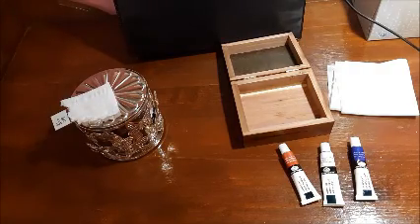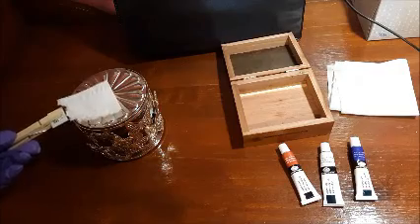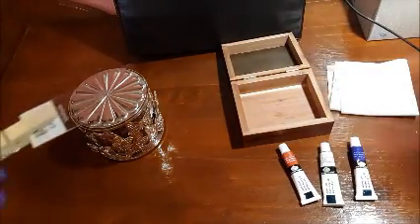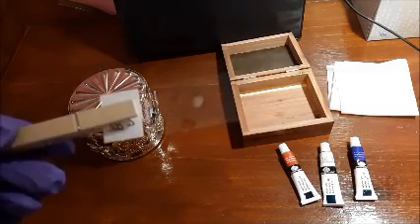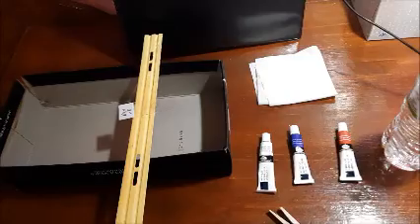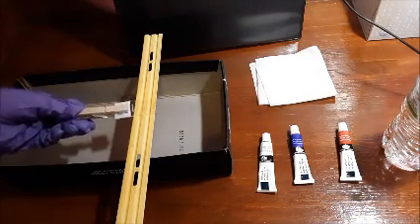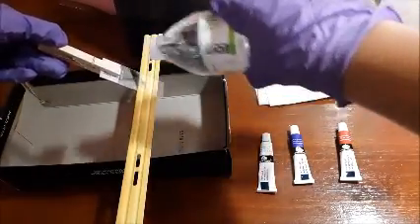After 10 minutes of steaming your heat fix slide, you will remove it using your slide clip, like so, and then carefully remove the bibulous paper. Since it's now been contaminated, you're going to get rid of it by putting it in the biohazardous waste container. And now we're just going to let the slide cool off. I'm going to put this on the slide rack that is on the stain tray, and then we'll continue on. Now that your slide has cooled off, you're going to rinse it in a gentle stream of water. But first, you're going to pick it up using your slide clip, tilt it downwards, and then rinse with water.